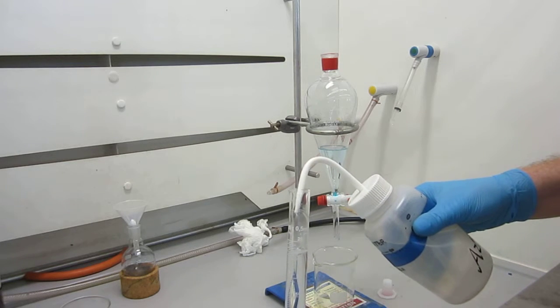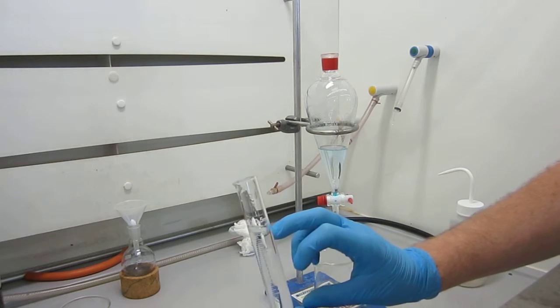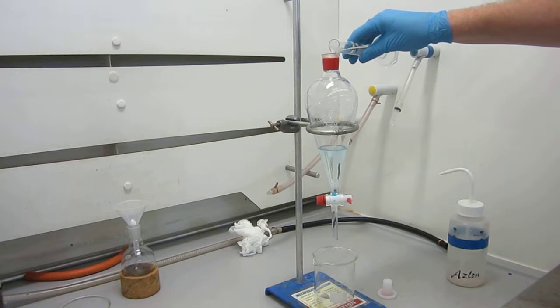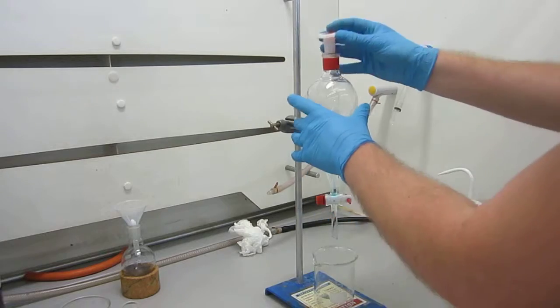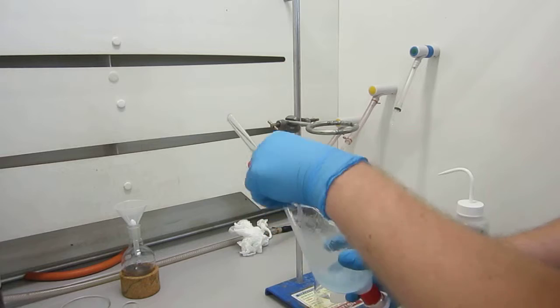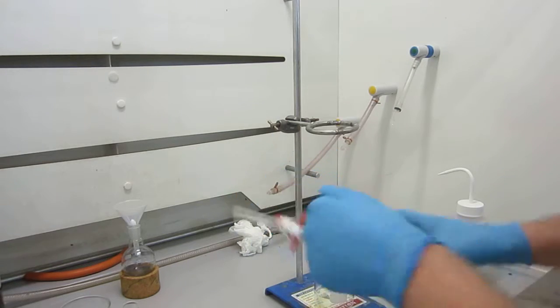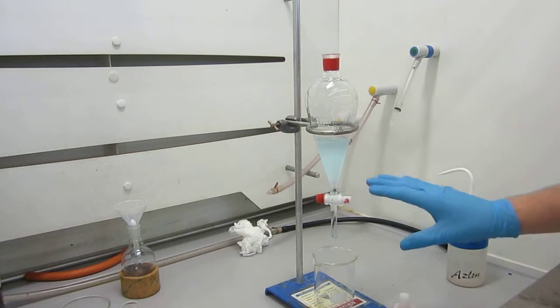If you read through the lab guide, you'll see that we explain the importance of using lots of little portions as opposed to one bigger portion. It's to do with concentration gradients. So that's going to go in, and then same as before, bung in, pull out, grab it, shake and vent. And the bung out. I'm going to let that settle.